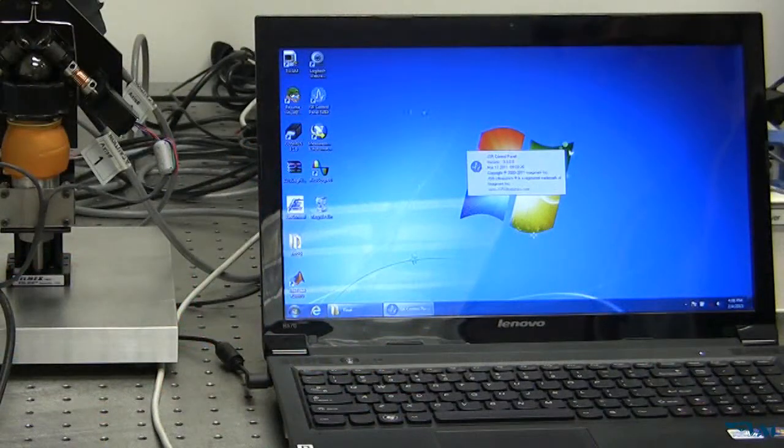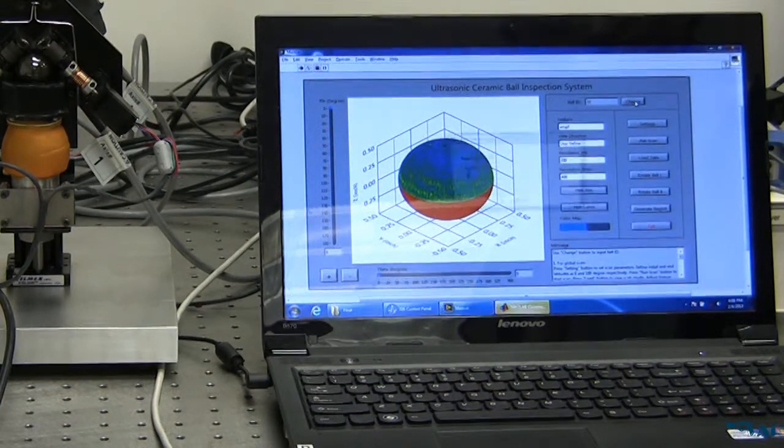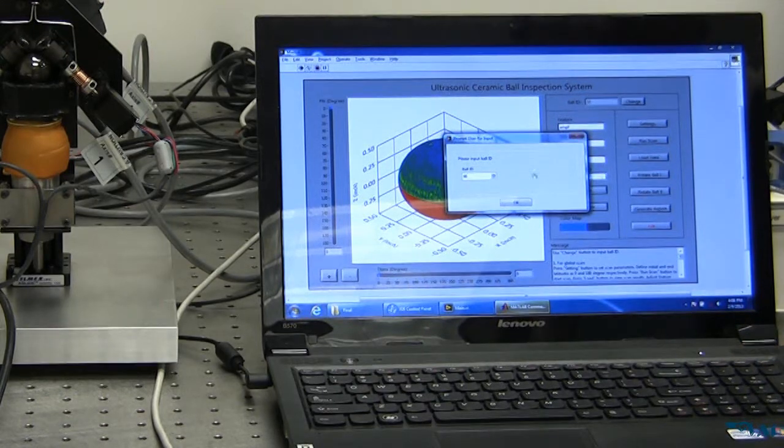To inspect the ball, double click the SWAM icon on the desktop to start the main SWAM program. Input the ball ID number in the pop-up window.